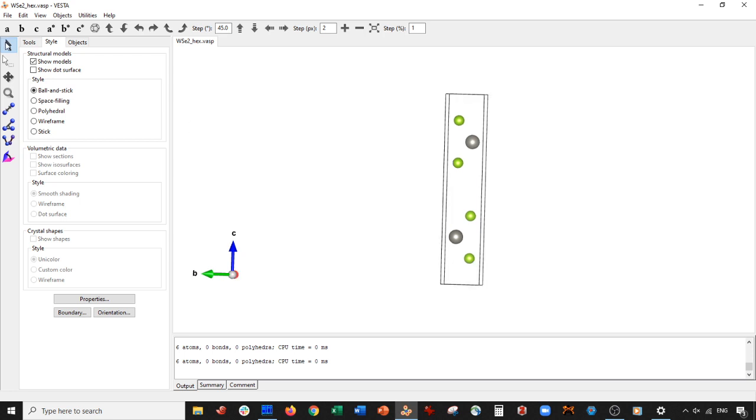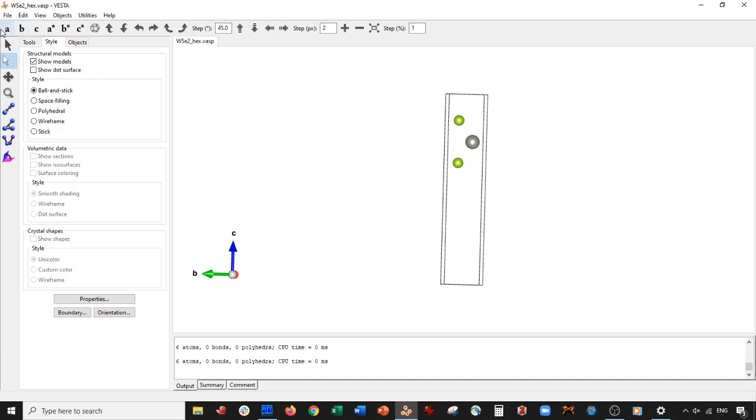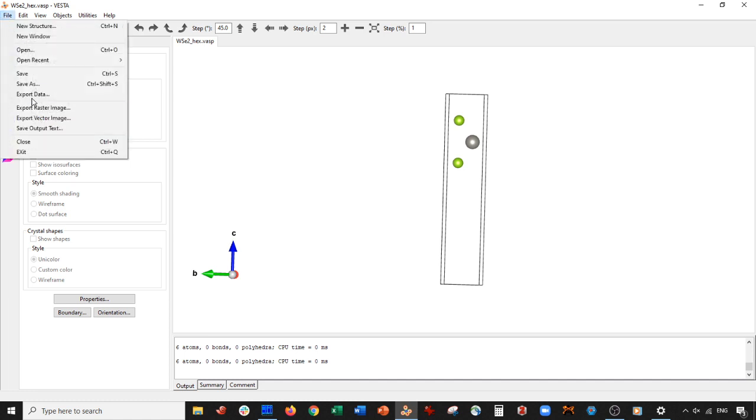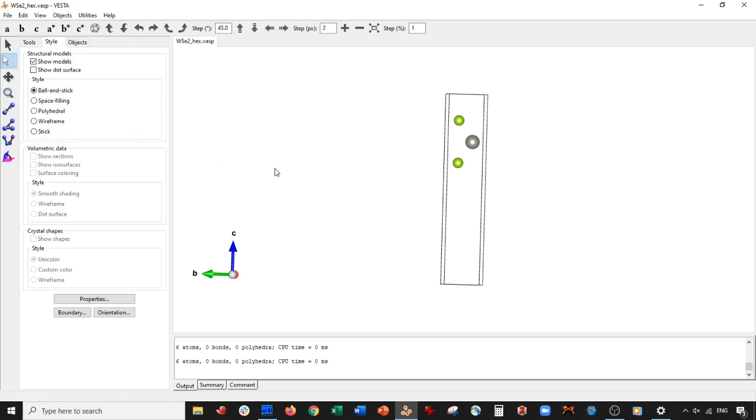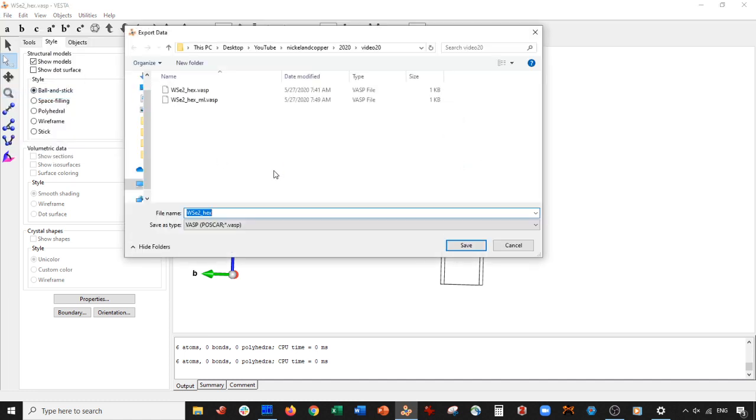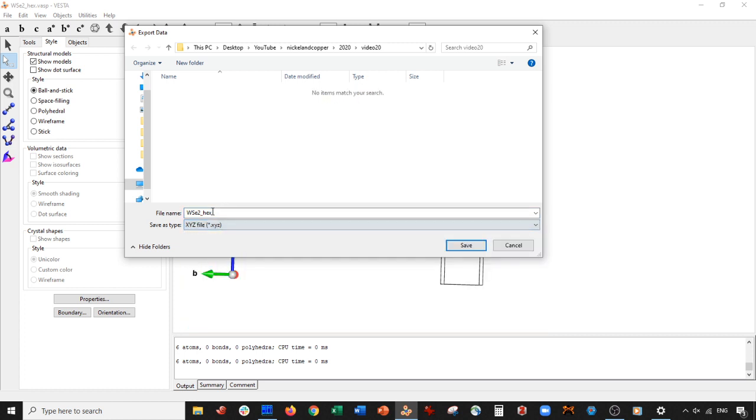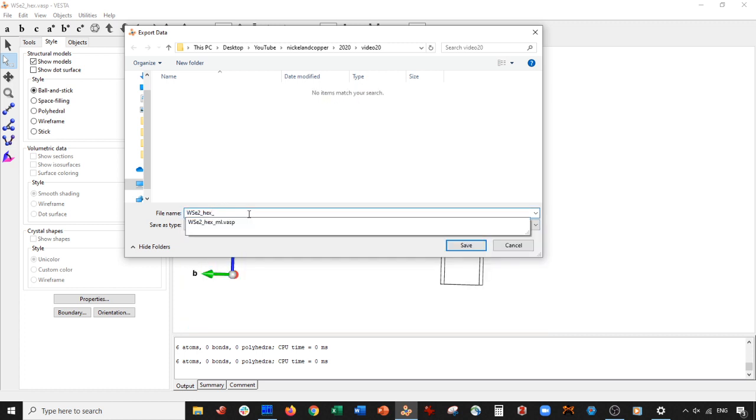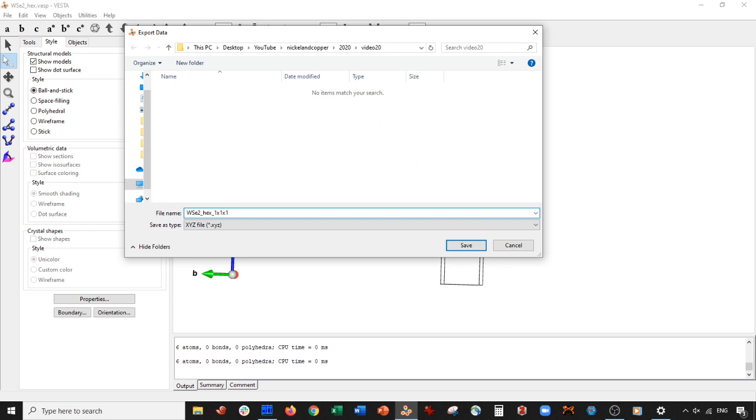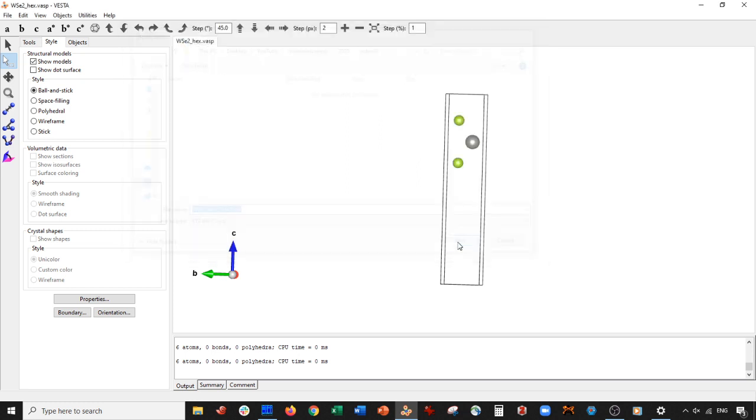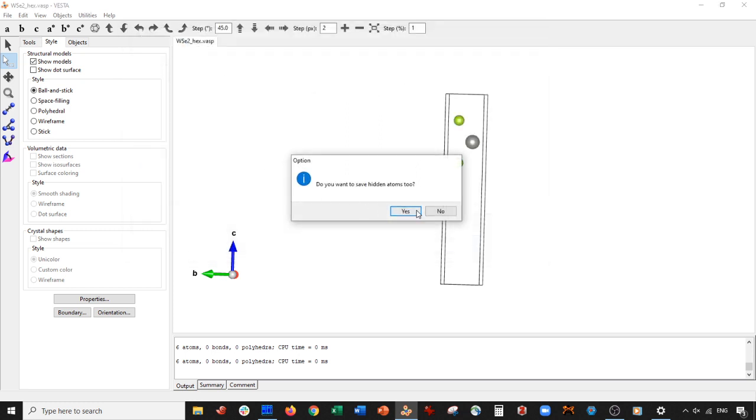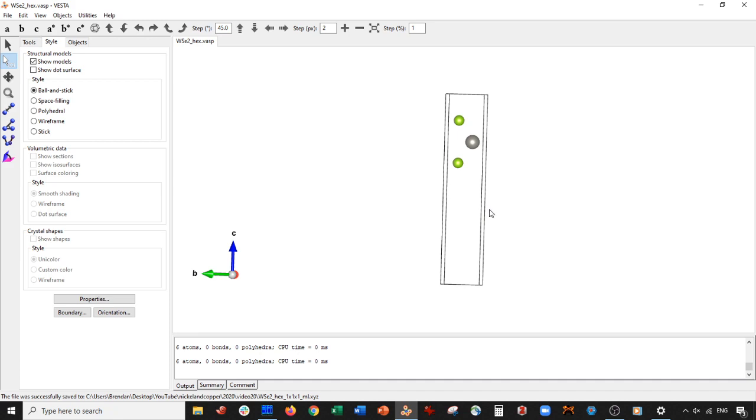So then we go ahead and we just delete this here, excuse my voice. And what we're going to do is we're going to save this as an XYZ. And I'm going to do this for you and then I'm going to do something else. So we'll save this as an XYZ. And I'm going to call it WSE2 hex. And I'm going to call it 1x1x1 monolayer. So go ahead and press save. Do not save hidden atoms.